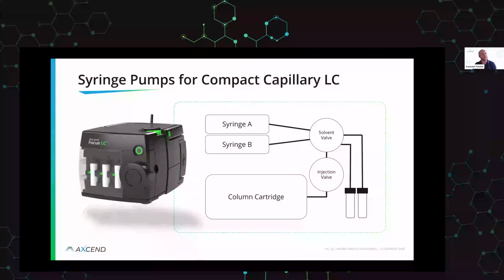It also keeps dwell volume optimized in the sense that we don't have to worry about things like pulse dampeners or the additional check valves. We don't necessarily have to worry about any of that. So it makes for a much more rugged application.